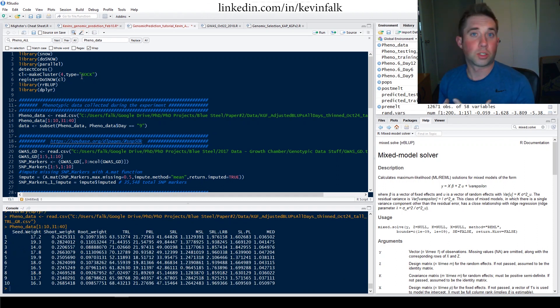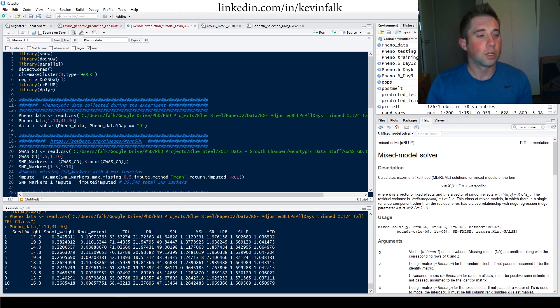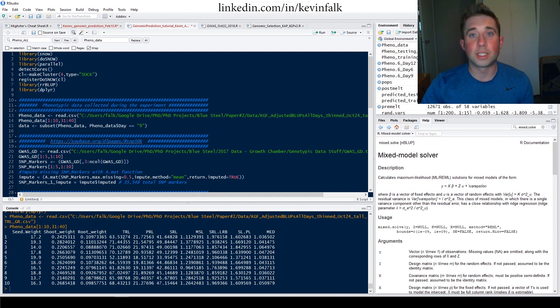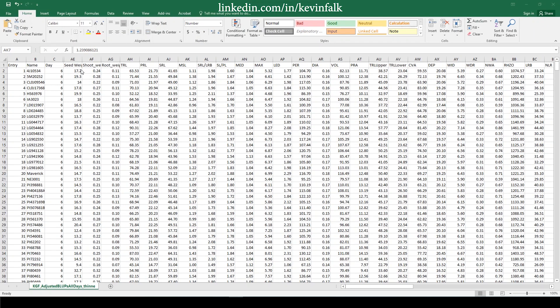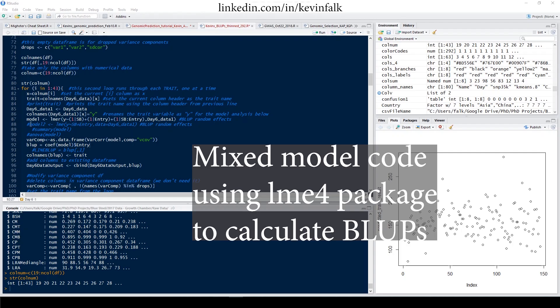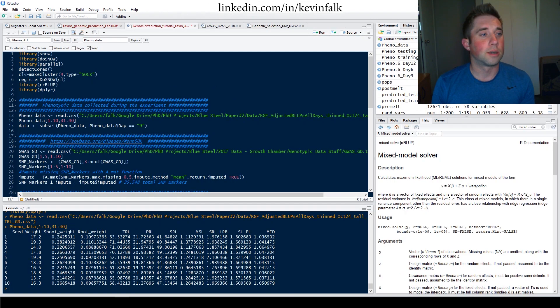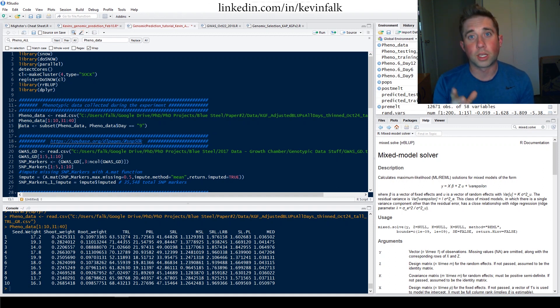I work in soybean roots and root traits, so here we have seed weight, shoot weight, root weight, total root length, primary root length, and so on. This is the data I'll be doing genomic selection on today. All the data points are BLUP values — a weighted mean — so for every individual entry I only have one unit per entry. Originally I had a number of reps, and I calculated BLUP values out of those reps so that I had just one variable to use for genomic prediction. For the tutorial, I'm just going to highlight one particular trait.